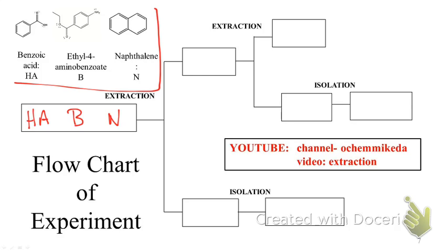For this reaction to work, I need to make sure all of those get dissolved. They're all organic compounds, all dominated by their London dispersion forces. So I'll add an organic solvent, diethyl ether. Now they're all dissolved. But if I'm trying to separate them, I need to put something else in there to cause them to separate. What could I add?